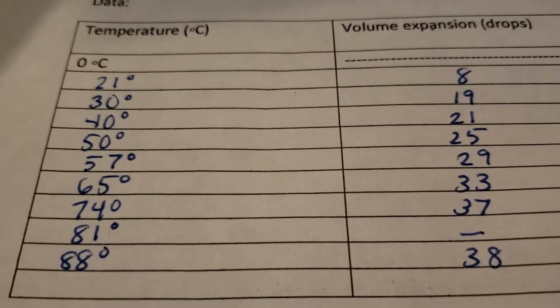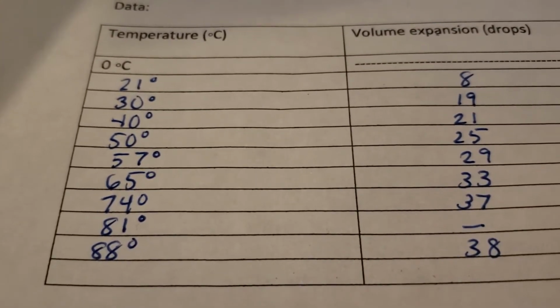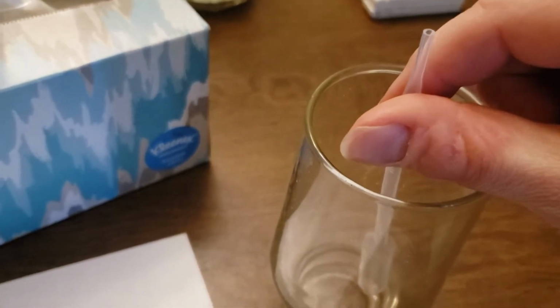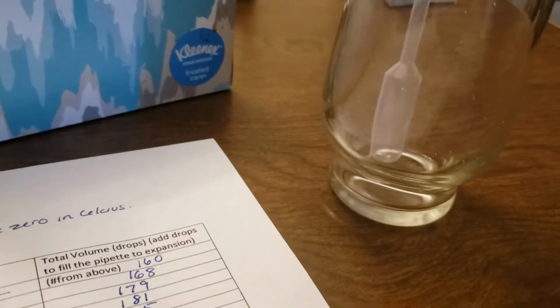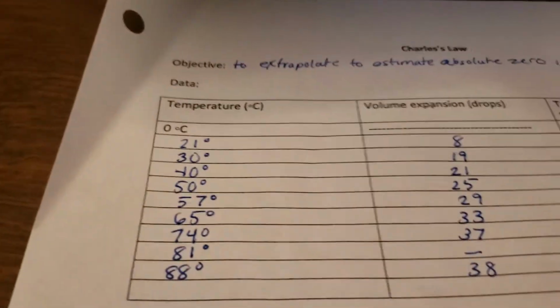So I basically took some water out of my ice bath, let it come up to maybe 21 Celsius, put it in something so that the whole bulb of the micropipette was underwater, so the gas can flow in and out. So we heat up the air with the surrounding liquid. The air in the bulb hopefully came up to 21 Celsius because the bulb was submerged.